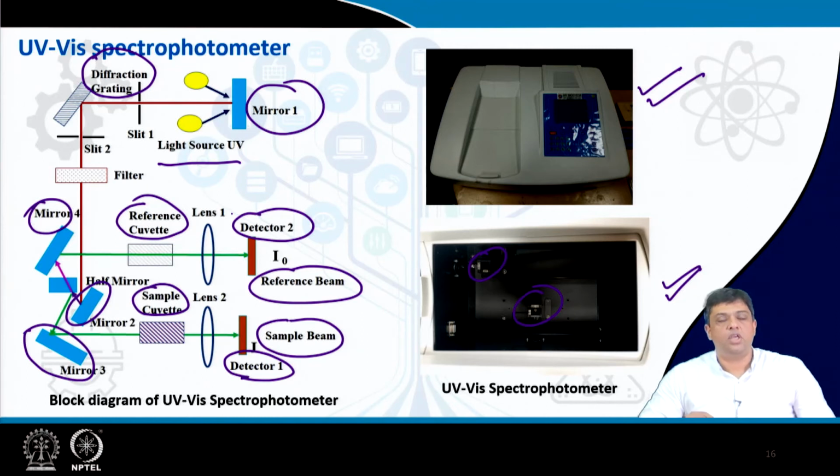So, you see the optics play a very critical role, and therefore while you are using these instruments, you should be very careful not to disturb them. Otherwise the optics, which are very sensitive to vibrations, will change and the data will not be what is expected, or you will get data that needs to be calibrated again with some standards.